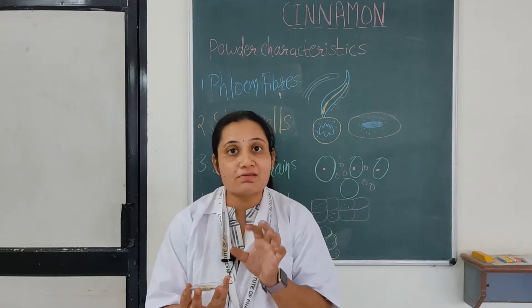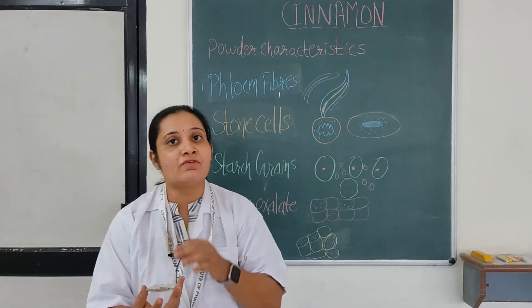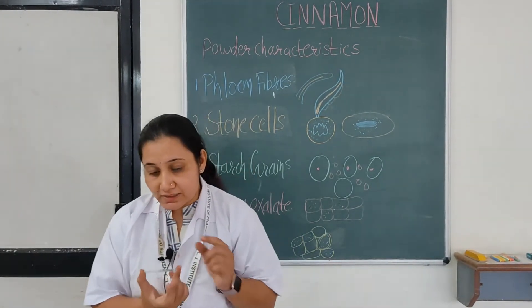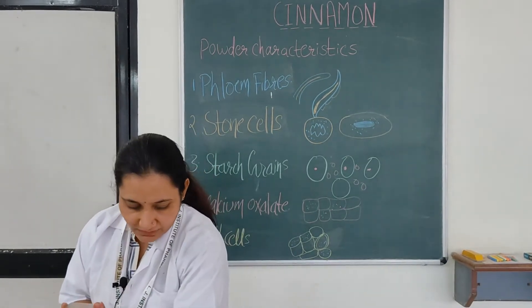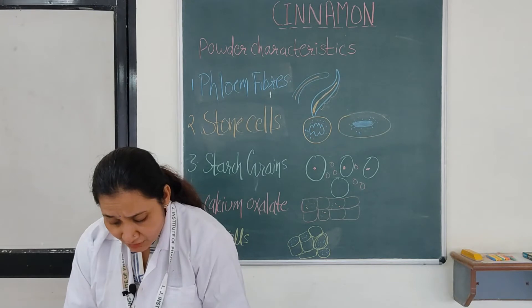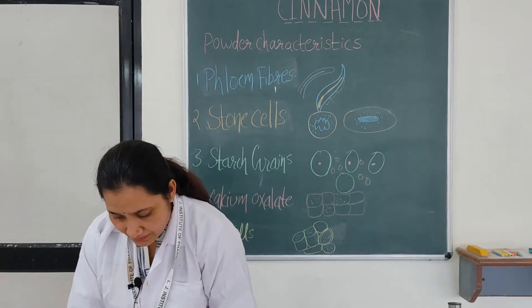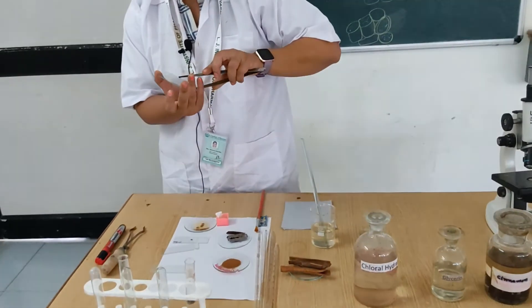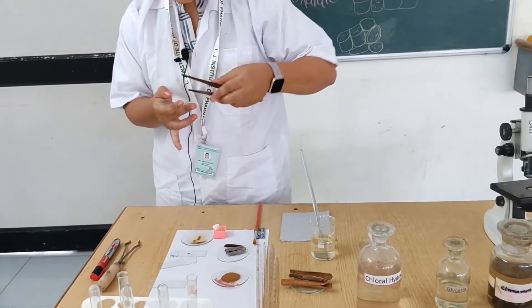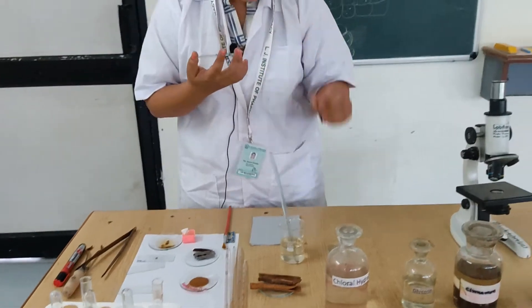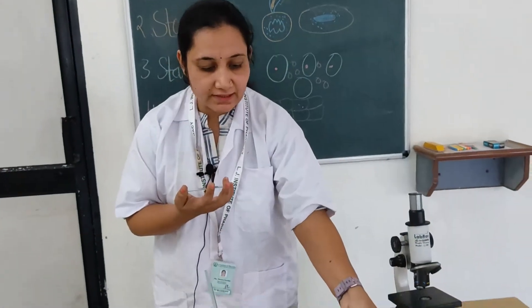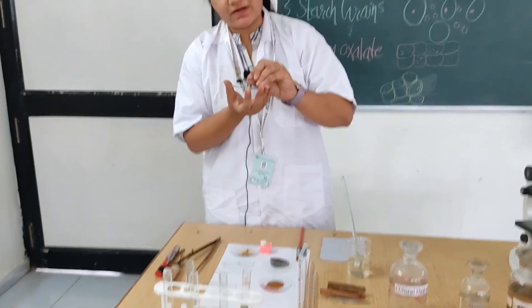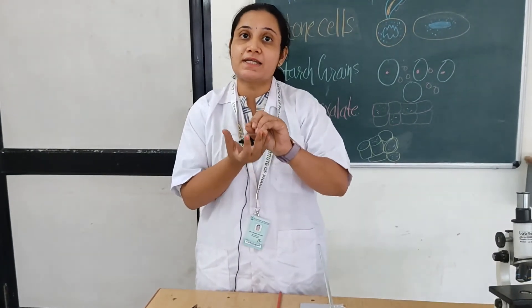Keep these sections in a watch glass containing water so that the sections do not dry. Remove the thick sections and select only the thin section. Then take a clean slide — we are preparing a temporary slide. Take one of the nice thin sections of the cinnamon, place it on the slide with a spanner, and add glycerin using a dropper. Then place the cover slip over it to prepare the TS for cinnamon.